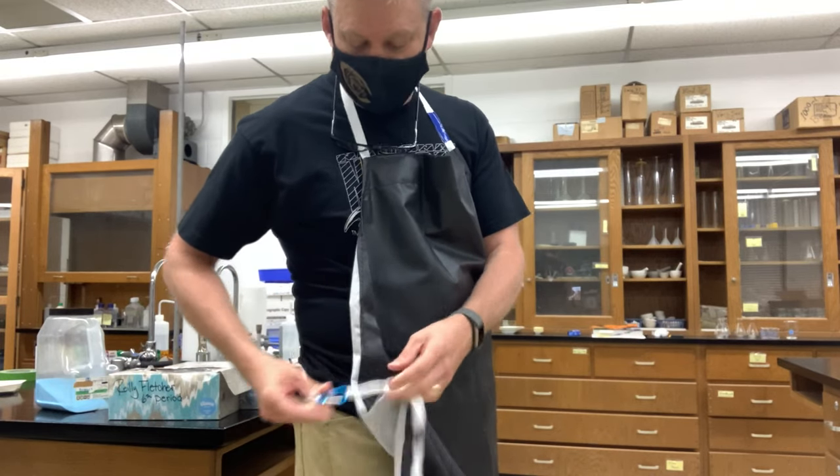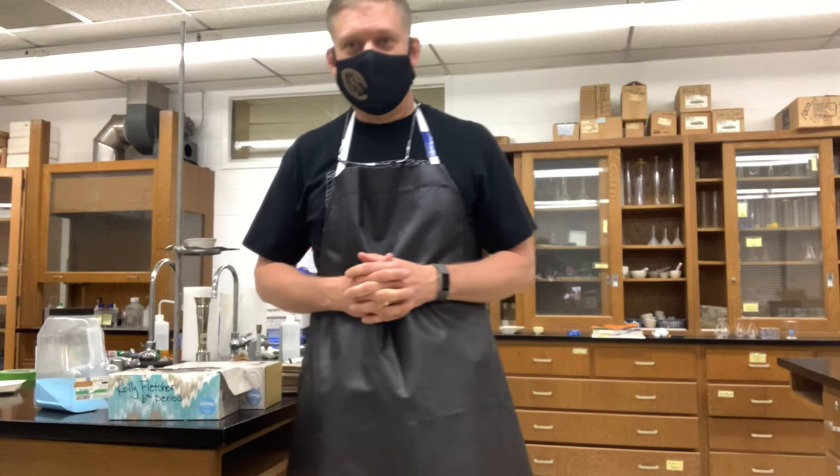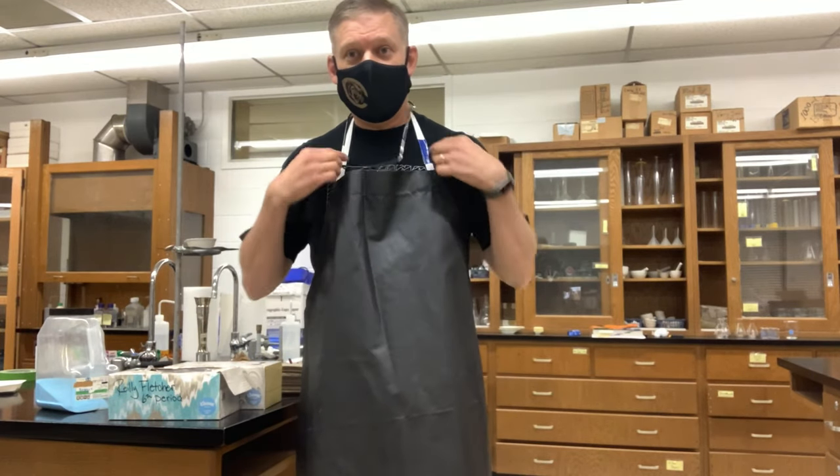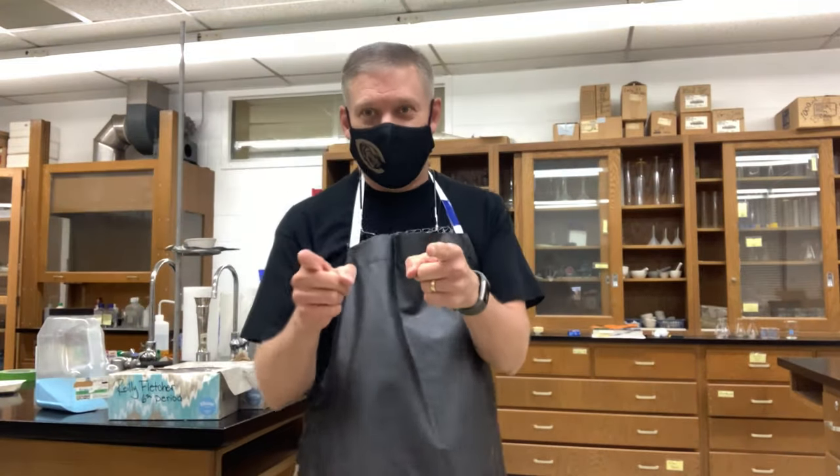Hope that helps everyone. It's a cheap fix, and we always love cheap in our house. I'll probably edit this video a little bit better, but that's how you make a lab apron — make it knotless, make it not have a knot.